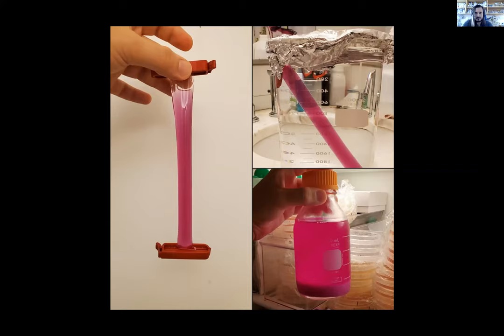After that, I started doing some dialysis and crashing out the cells with chitosan. So chitosan I really like because it's a flocculating agent that doesn't involve aluminum. So normally, in large-scale bioreactors, you need to make the cells go down, right? And you can't spin 100 liters. That's ridiculous. You'll be spending so much energy on this.